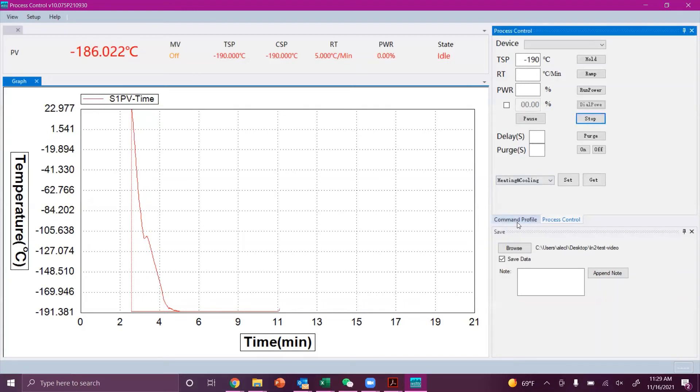When your experiment is done, simply press stop or you can activate the heater to warm back up the sample area for quicker experimental cycling times.